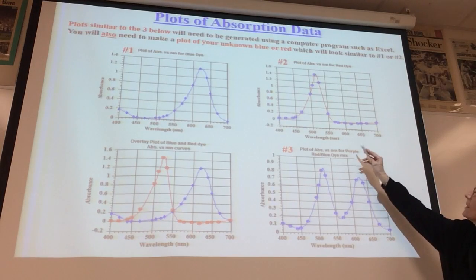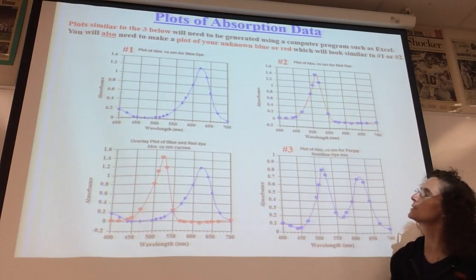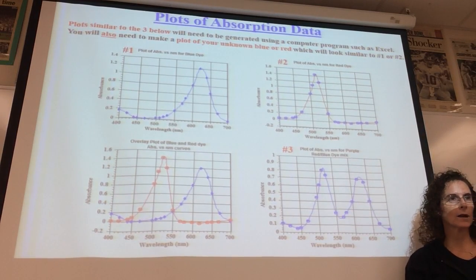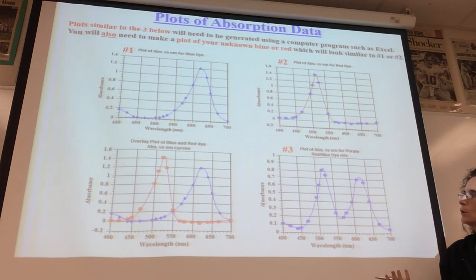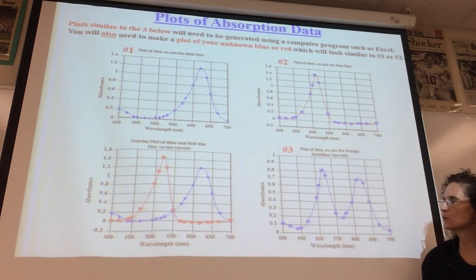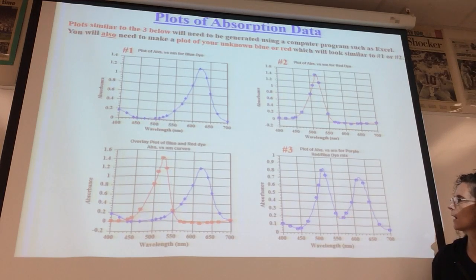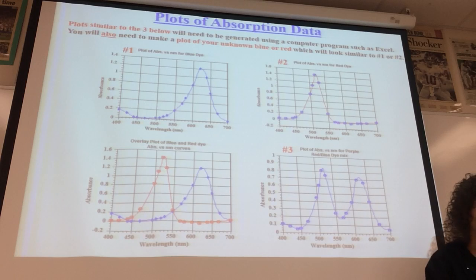Red dye will peak maximum at 520 or maybe about 515, and so that's the wavelength that you would set the machine for red dye. Purple, you know, is comprised of both blue and red, so you can see the superimposing of the two different curves on that graph, and then here's the blending of them here.